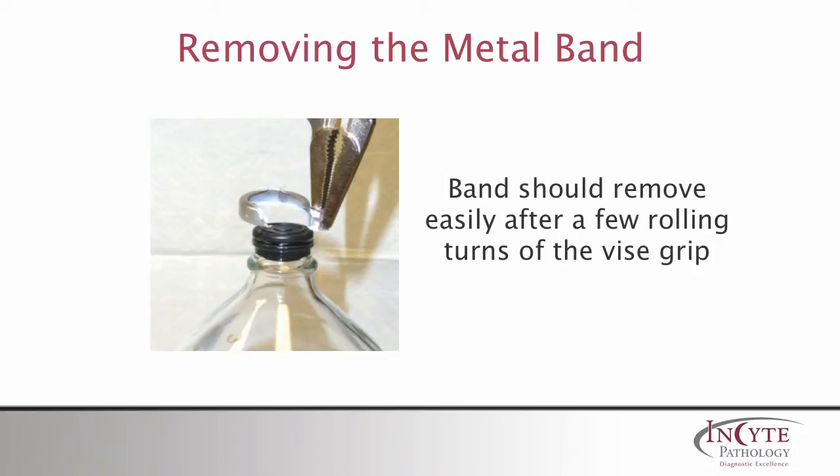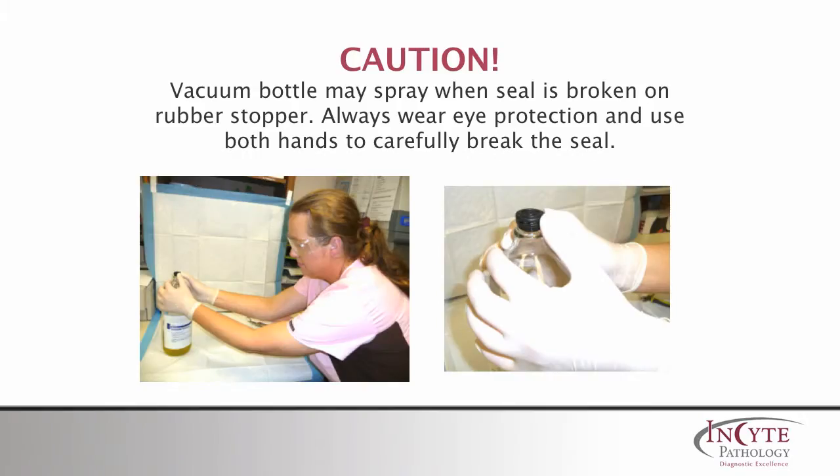The metal band should now easily remove after a few careful rolling turns with the vise grips. Throw the metal band into a sharps container. Very important: the vacuum bottle may spray once the seal is broken. Always open the bottle in a clean area while wearing eye protection and using both hands to carefully break the seal.